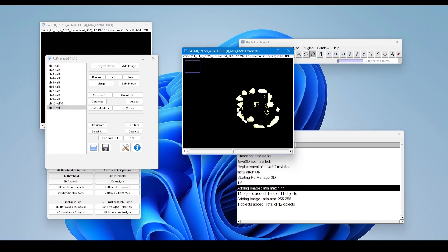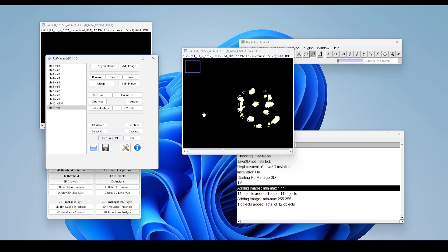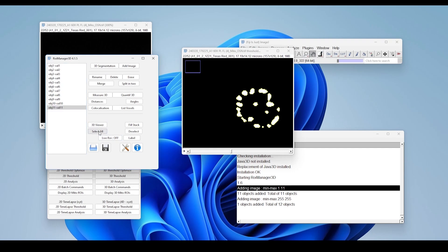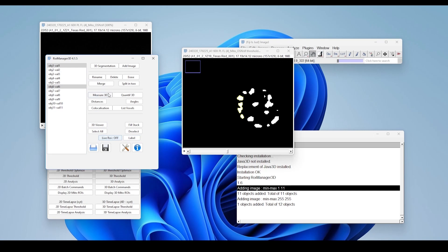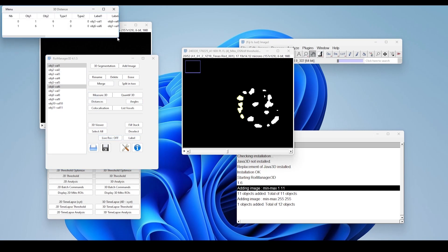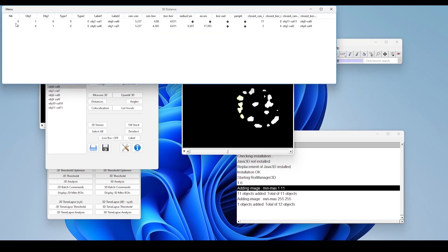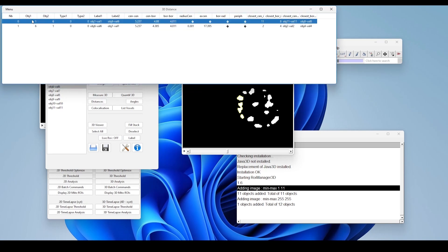Now let's talk about what you can actually do with this ROI data. One of the questions you can ask with this setup is: what is the relationship between the mitochondria themselves and their distances? For example, mitochondria number 1 and number 6 — with the click of a button you can get the distances between different objects. Object number 1 and 6 are approximately 4.011 microns apart, border to border.